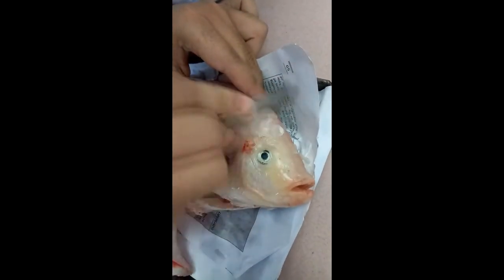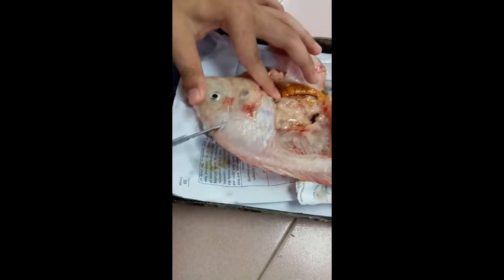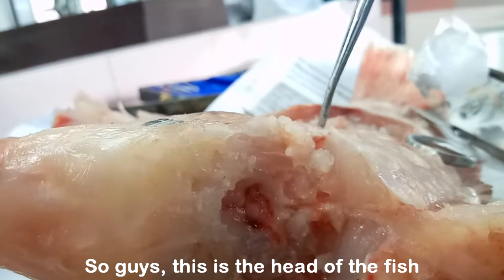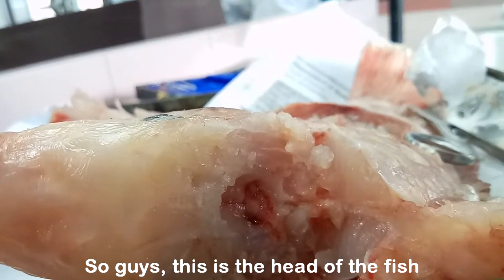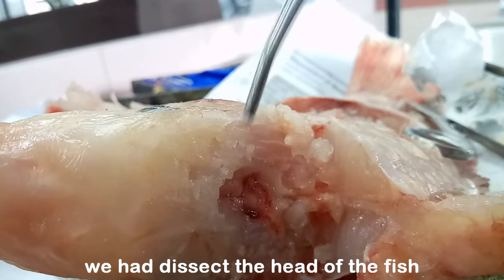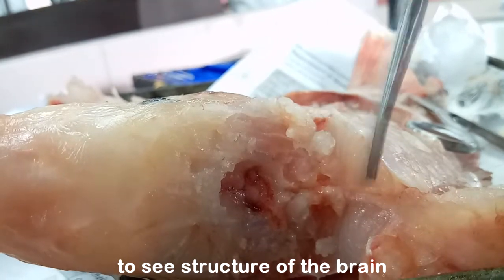Okay, now we are going to dissect the fish to see the brain of the fish. So my friend here is going to dissect the head of the fish. We have to have high passion to do this. So okay guys, this is the head of the fish, and we have dissected the head of the fish to see the structure of the brain.